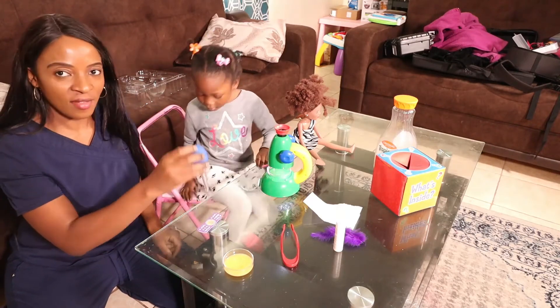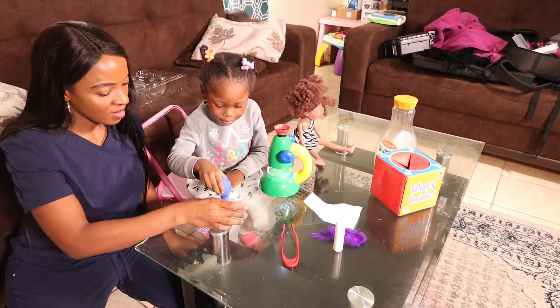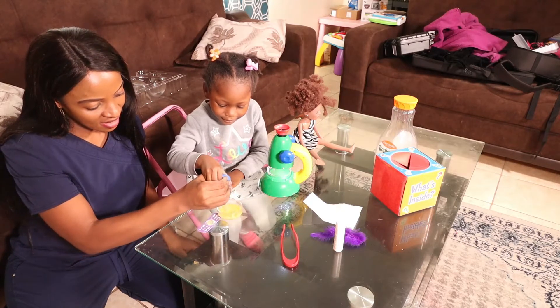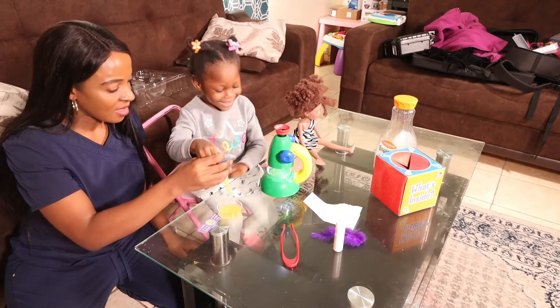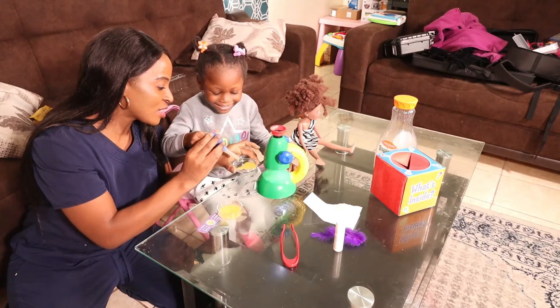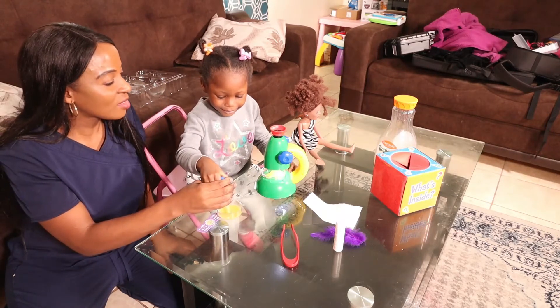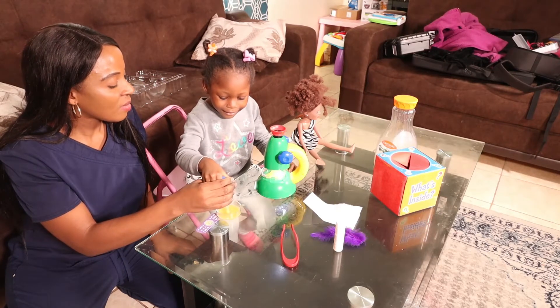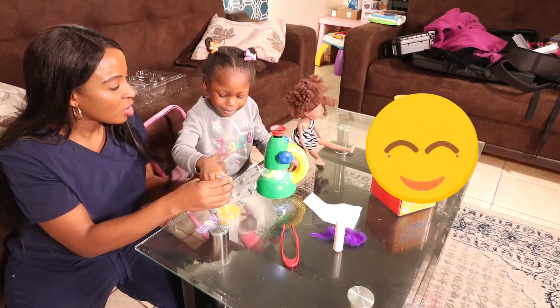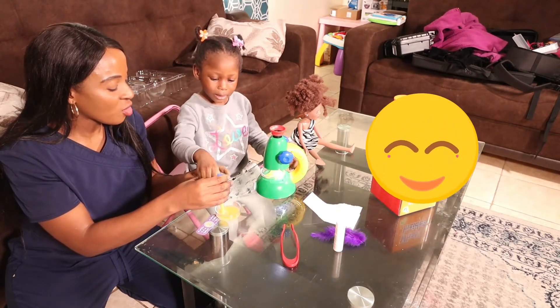Next she's going to use the dropper to take some of the specimen from the petri dish and put it in the other petri dish, then put that under the microscope to see what it looks like. Now she's dropping it and I'm assisting her with hand-over-hand. You know, science is fun — she's enjoying it. She appears to really like the squeezing because I can feel her hand.